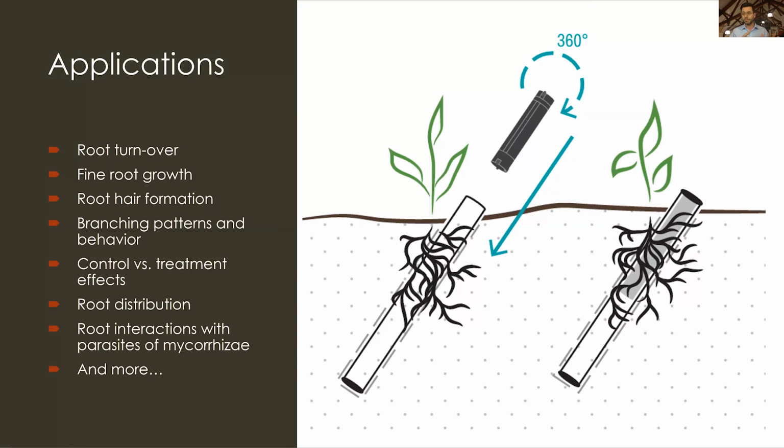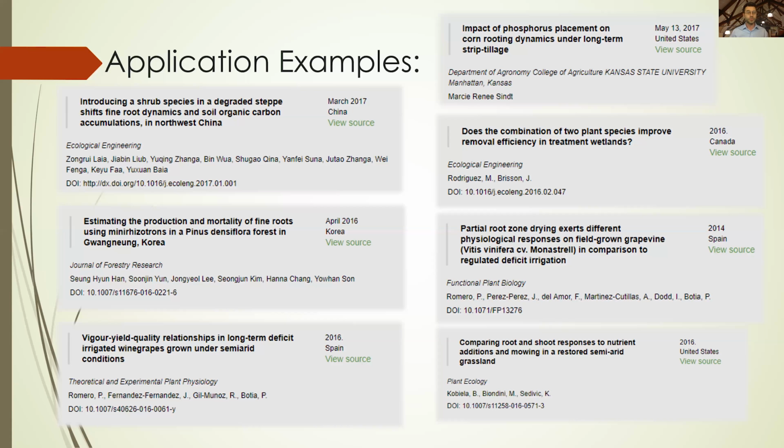We can do a lot of the application studies and tests here on our site, but a lot of this work has been done by researchers like you, and I'd like to show some of the examples. We do show some of these on our website. We try to get as many of them as possible, but so many are coming in where they're using, especially the 600, since it's been around for 10 years now. And now the CI-602, even though it's been around for only a year, there are already some requests coming in.